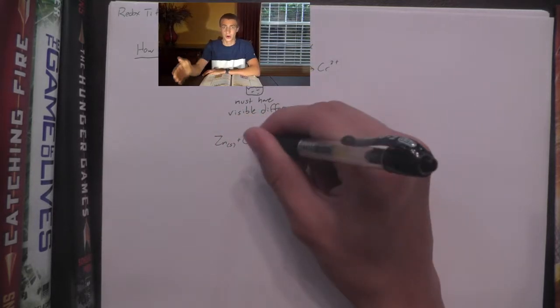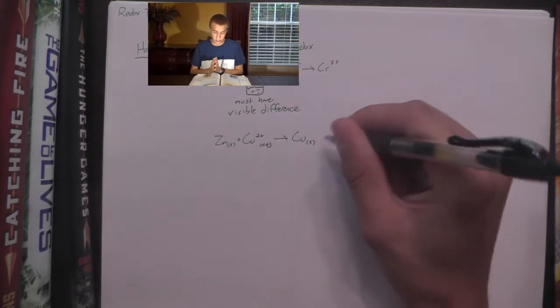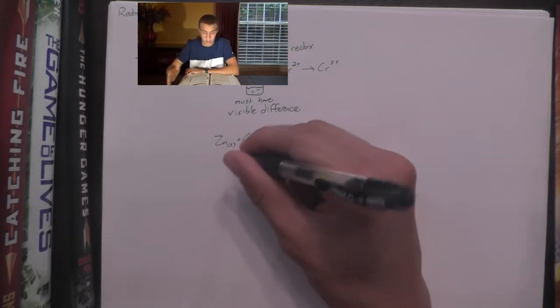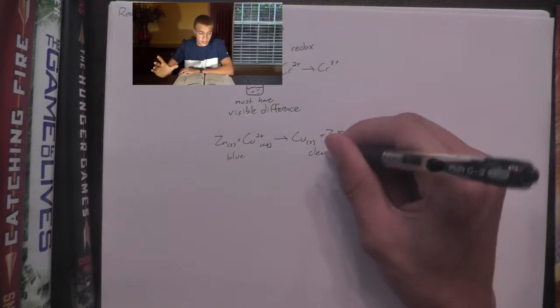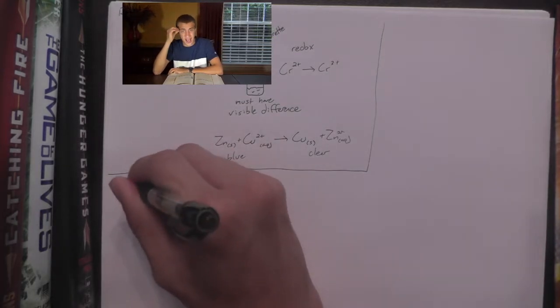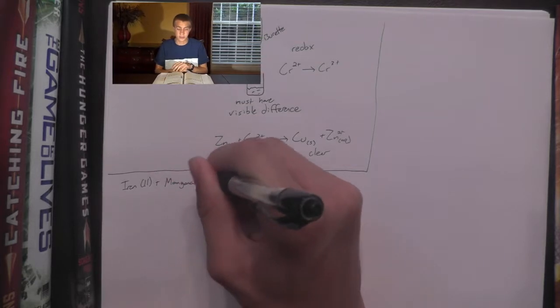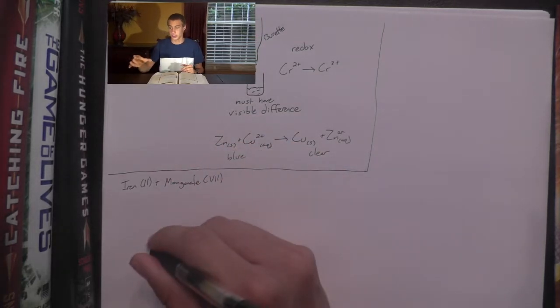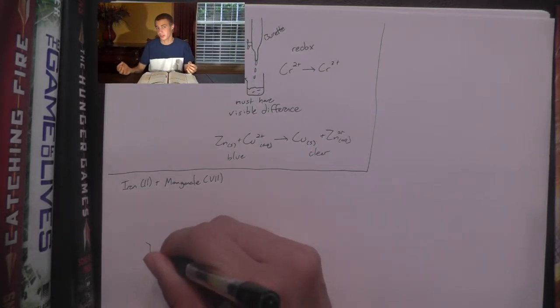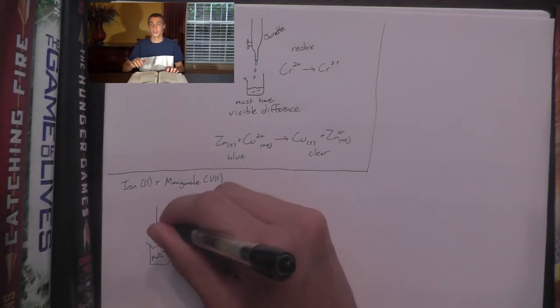So you have your burette, and you're going to place whatever your known quantity is. Same thing. So for this case, we're going to be taking the example of the analysis of iron with manganate(VII). So in your burette, you could say that you have your iron solution, with iron ions, and as you drop those in, they're going to combine with the manganate ions in the solution below, and over time, once you see that change in color, which is typical of a titration, you will then know that you have achieved your full reaction.